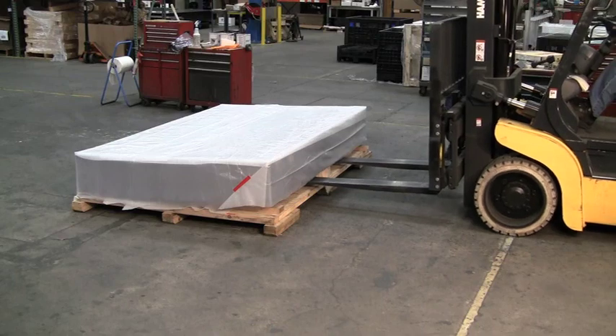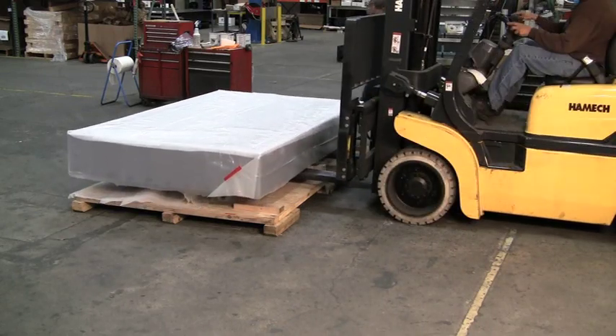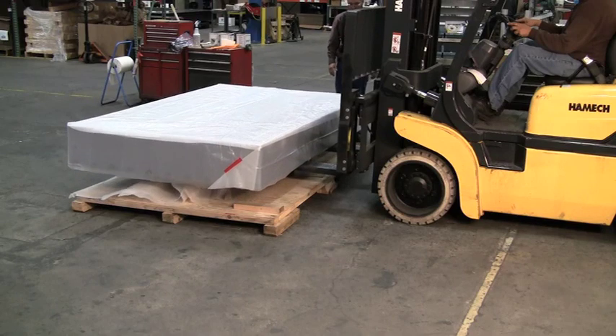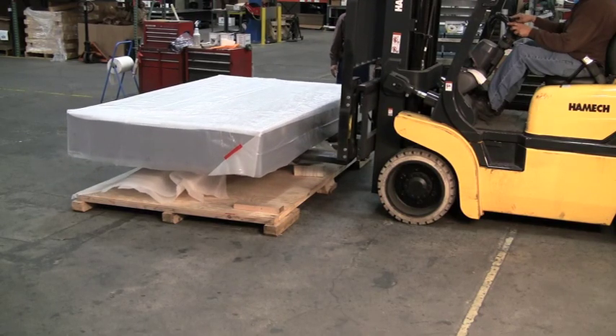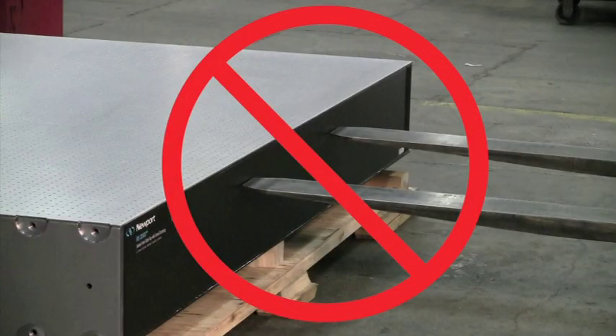If the table section and skid are too small to allow for bending of the skid, you may need to manually push the table off the skid several inches to allow lifting forks to lift the bottom of one corner of the table to create access to insert spacer blocks.